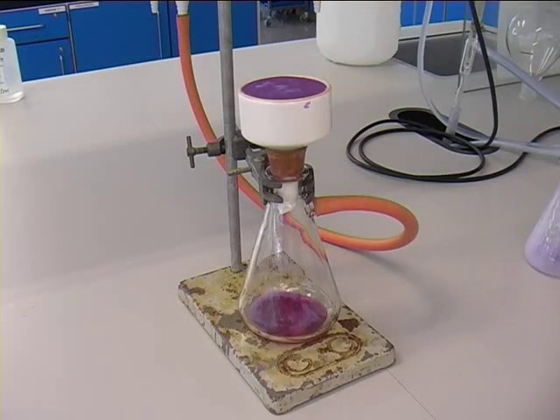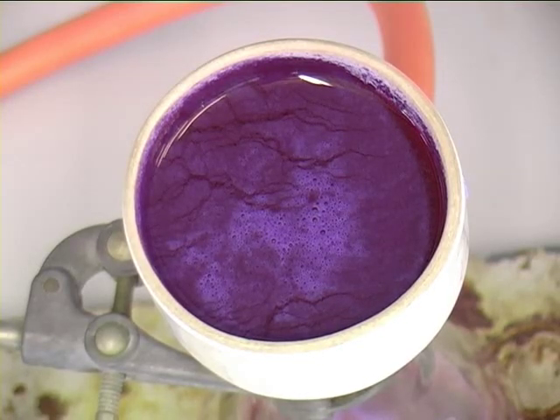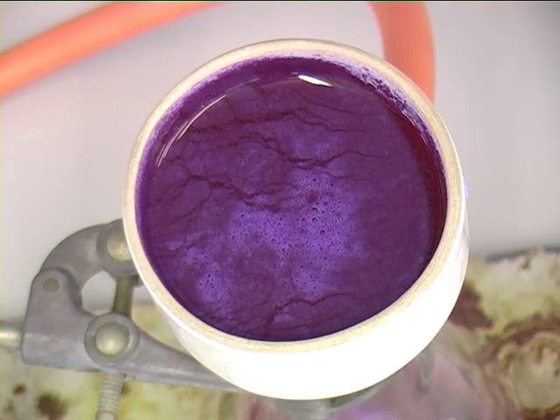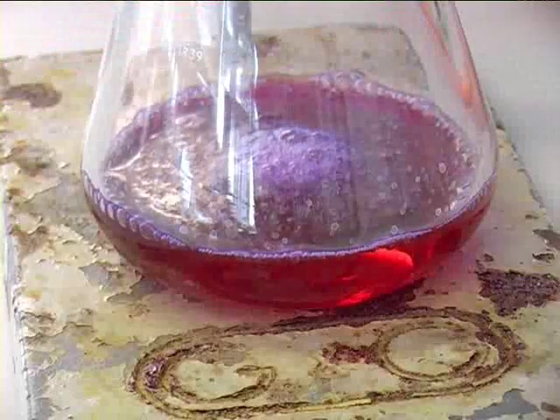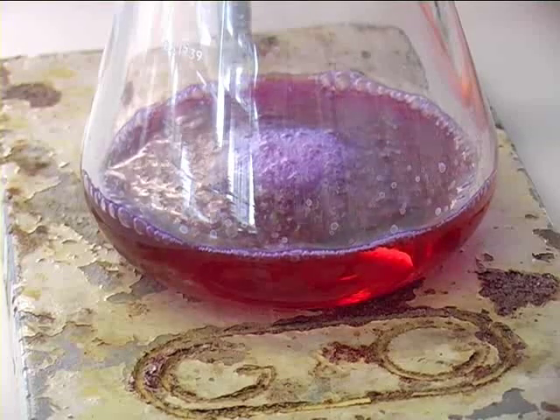As shown here, not much is left. This is a view from the top — the solvent will be slowly sucked through. Notice how the filtrate in the Buckner flask is clear, which means none of the solid has been sucked through the filter.